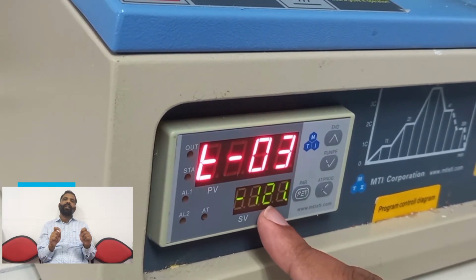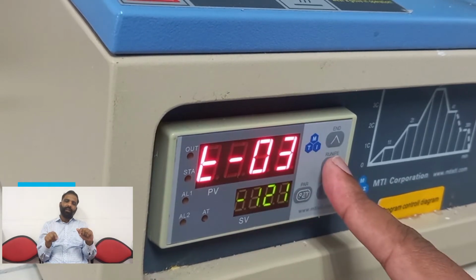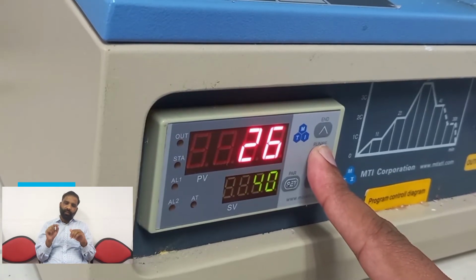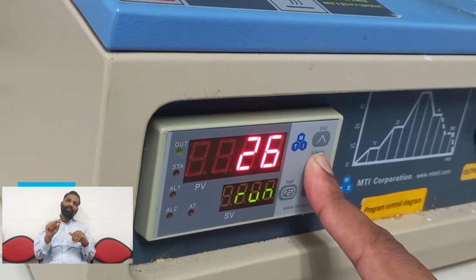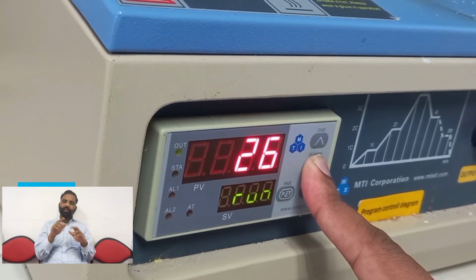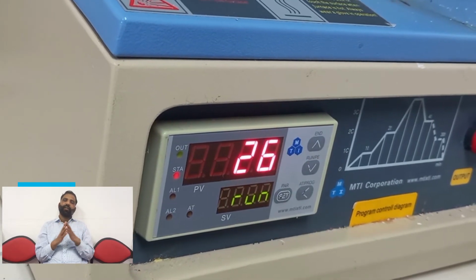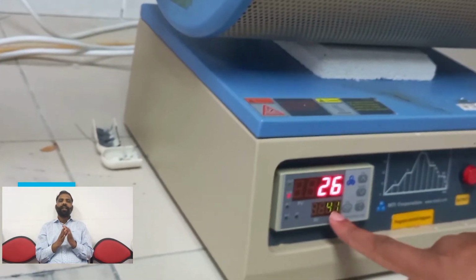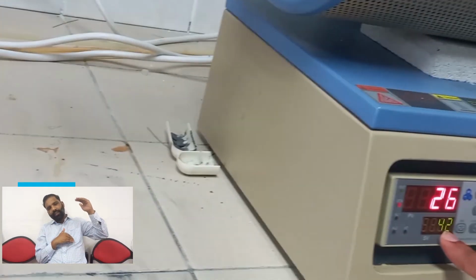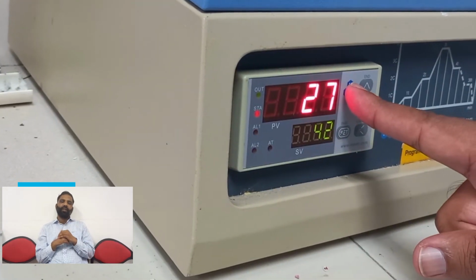So after setting the temperature and time values, we press the key run. It takes around 30 to 50 seconds. Press the run key continuously. When it starts, then you leave it. So after 88 minutes your temperature will reach around 920 centigrade.